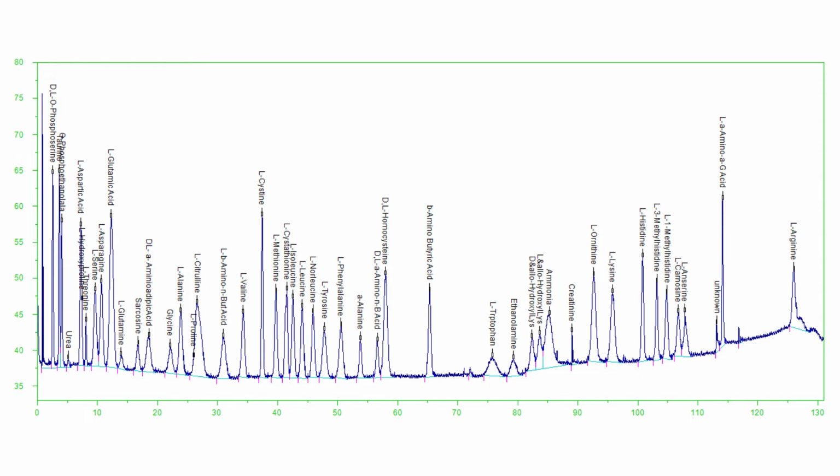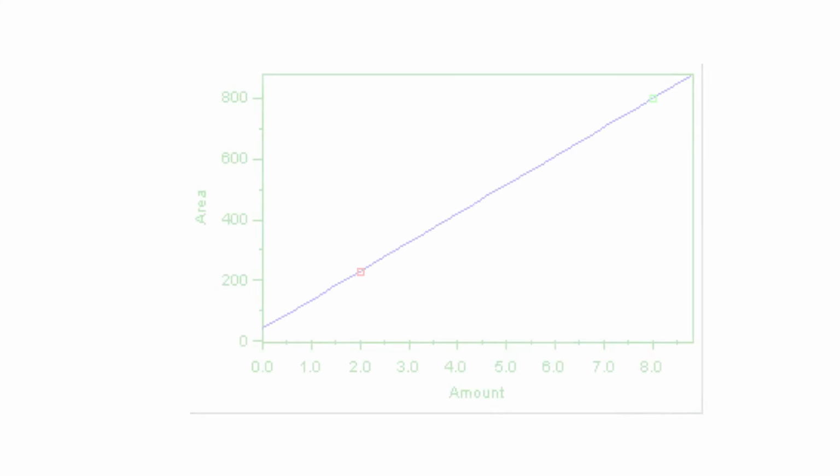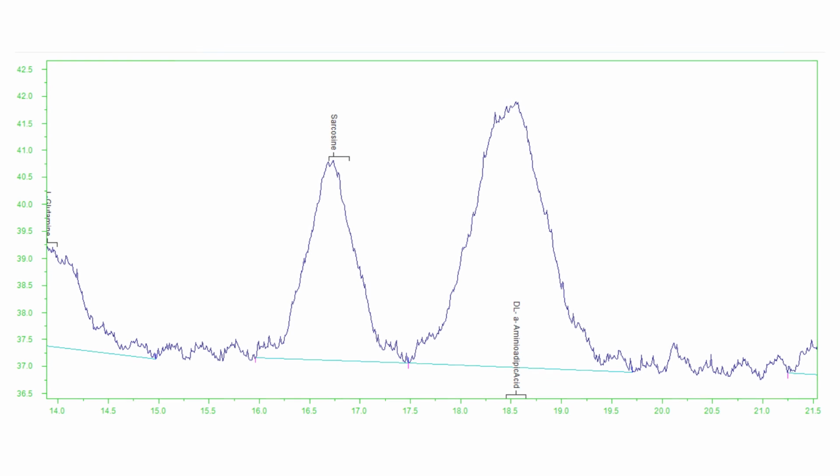The effect of this noise is to depress the baseline, causing an increase in measured peak area or height that is largely independent of peak size. It therefore acts to raise all the data points by the same amount. The calibration curve, a line through these points, is raised by a similar amount, which we see as a positive intercept. Therefore, when confronted with a positive intercept, one should estimate the amount of excess response that may be contributed by the noise. When quantifying by height, this is approximately equal to the peak, not peak-to-peak, noise.